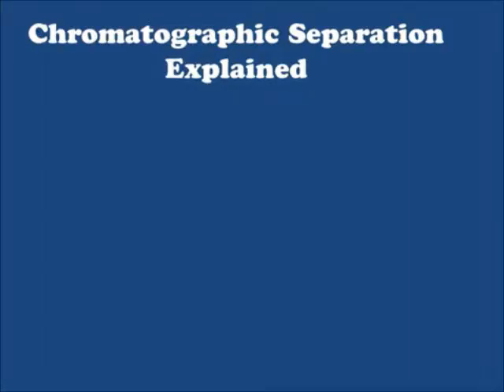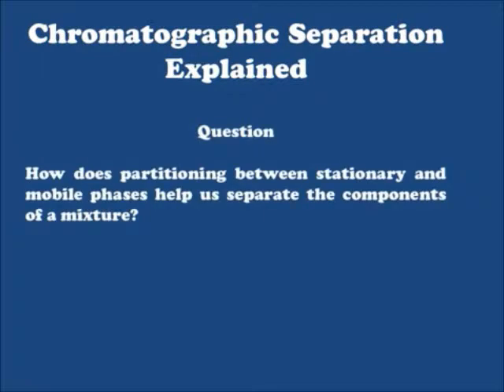All right, let's begin discussing a little bit about how chromatographic separation works. I want to give you a quick rundown and an animation of some of the underlying principles, and how to think about the way a molecule will behave in one of these chromatographic systems. We're going to start with a question. How does partitioning between stationary and mobile phases help us separate the components of a mixture? So we're going to get down to the underlying root principles of chromatography here.